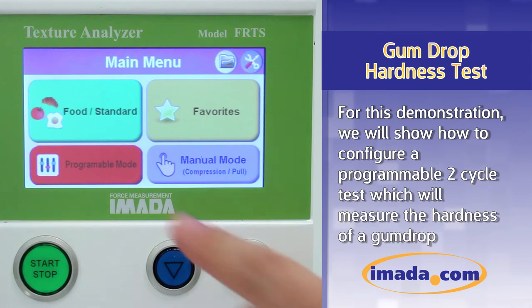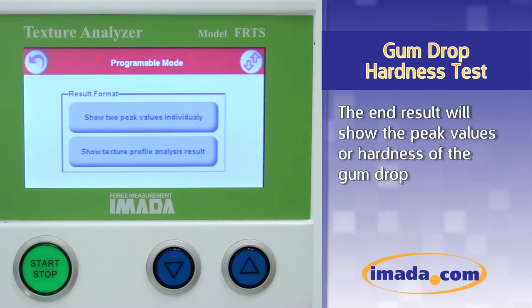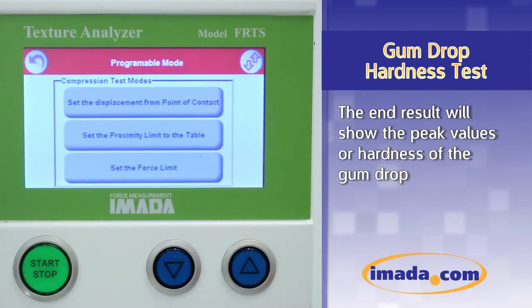For this demonstration, we will show how to configure a programmable two-cycle test which will measure the hardness of a gumdrop. The end result will show the peak values or hardness of the gumdrop.